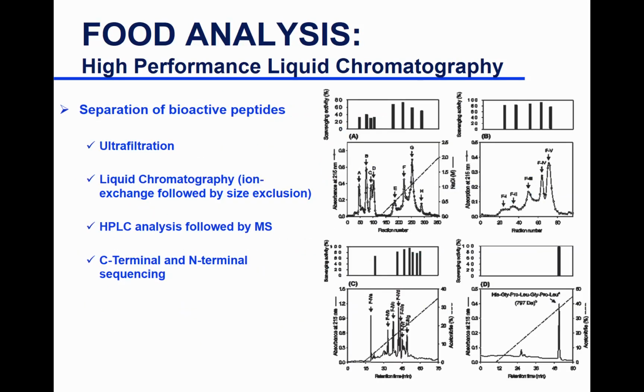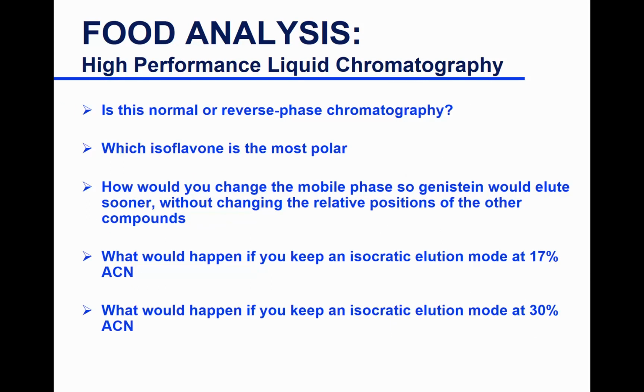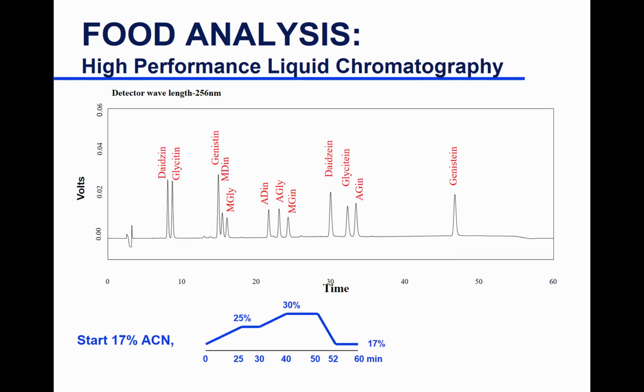Okay, good. So how do you know what concentration to use, because you're dancing a fine line between having really thin peaks super close and then having them too wide where they're all together? Let me tell you, I spent a whole year on this. As a postdoc at Purdue, I spent literally a year trying to get good separation. It's just experimentation. You try different things, trial and error with your method until you get the best resolution. A lot of experimentation is really trial and error, especially analytical experimentation.